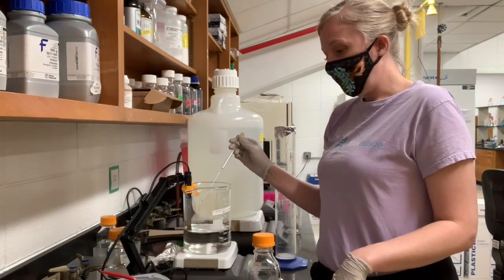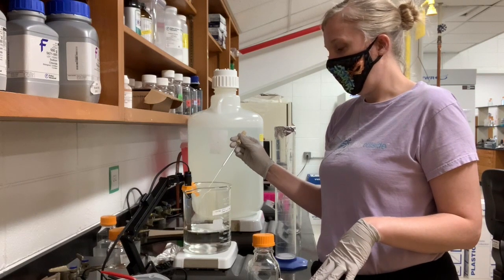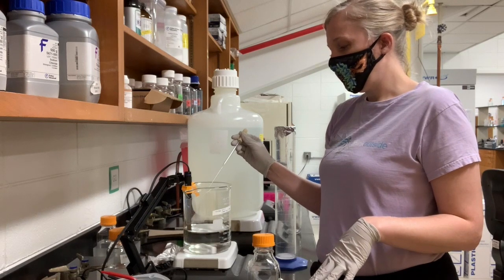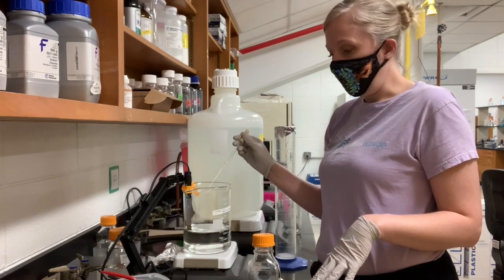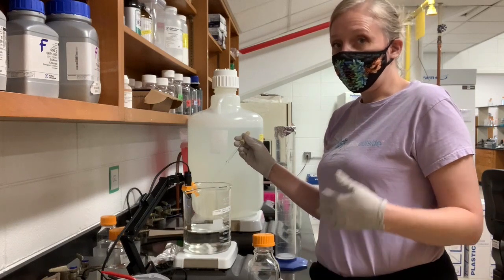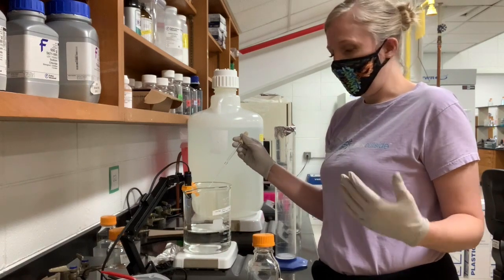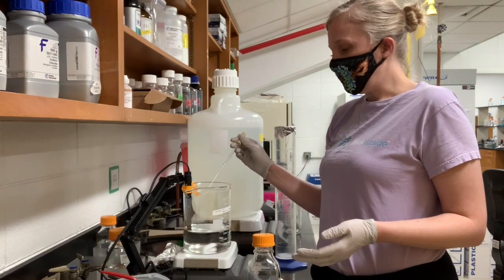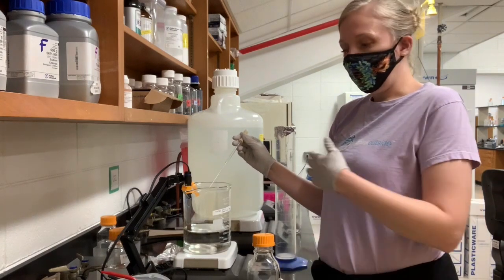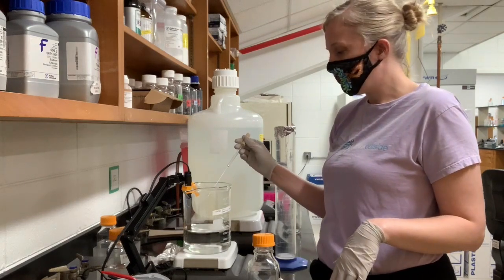So again, you want to make sure this is still saying stabilizing and changing as you add the strong base. Once you get closer to 7.4, which is where you're hoping to go, so I'm at 7.32, I'm going to slow down this process because it will take a minute for each droplet to fully diffuse into the solution and change the pH. So whereas at first I'm letting it go drop, drop, drop, now I'm adding a drop and I'm letting it stabilize so that I make sure I don't overshoot my pH.